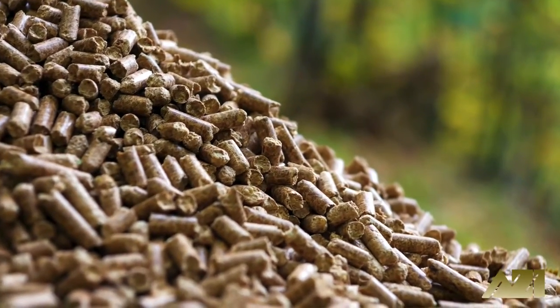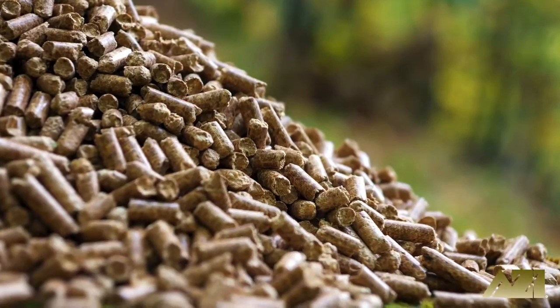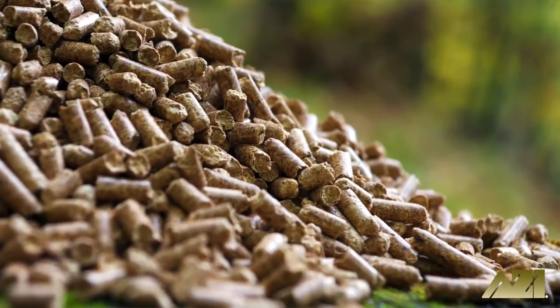As a general rule of thumb, the lower the ash content, the higher quality of the pellet or other material that is being burned.